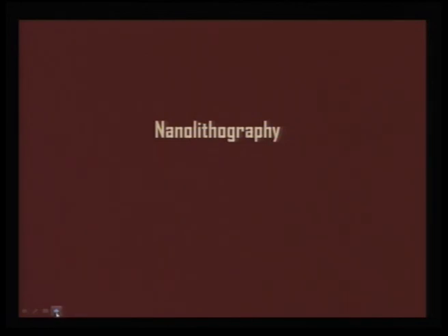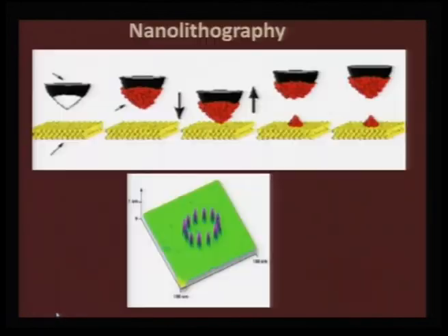Nanolithography, most of the time these view slides are shown as an example where you can actually try to decorate any surface the way you want. Therefore, this is a very useful technology by which lithography can be engineered.